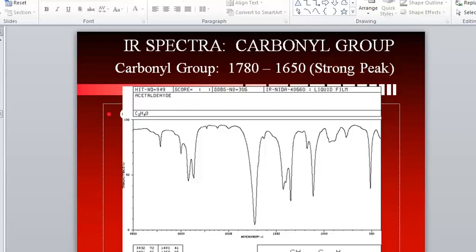Here's 1500, there's 1600, there's 1700, right there at that tick mark. This is slightly over to the left, and that's okay because we know there's wiggle involved. And I see a very strong peak that comes down and comes right back up. This is not broad, but maybe it's not narrow either. So this is a very hard peak to describe as far as width goes, but we can at least say it's very strong. So that's the presence of a carbonyl functional group.